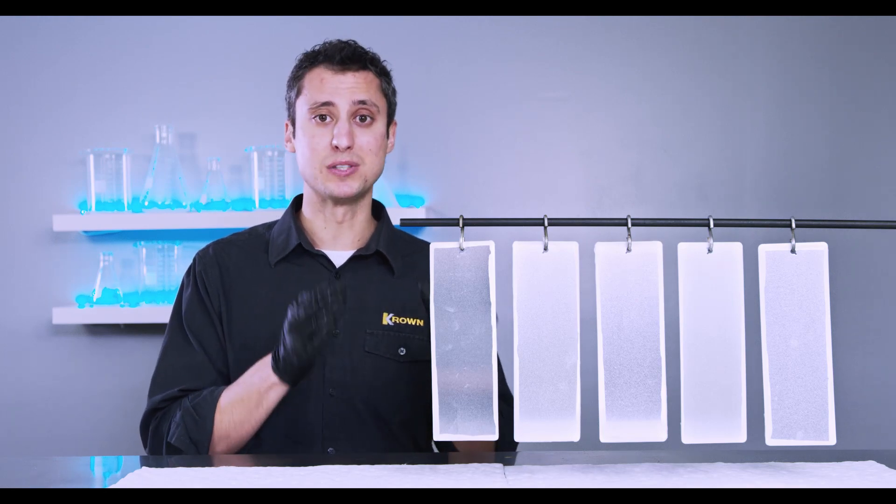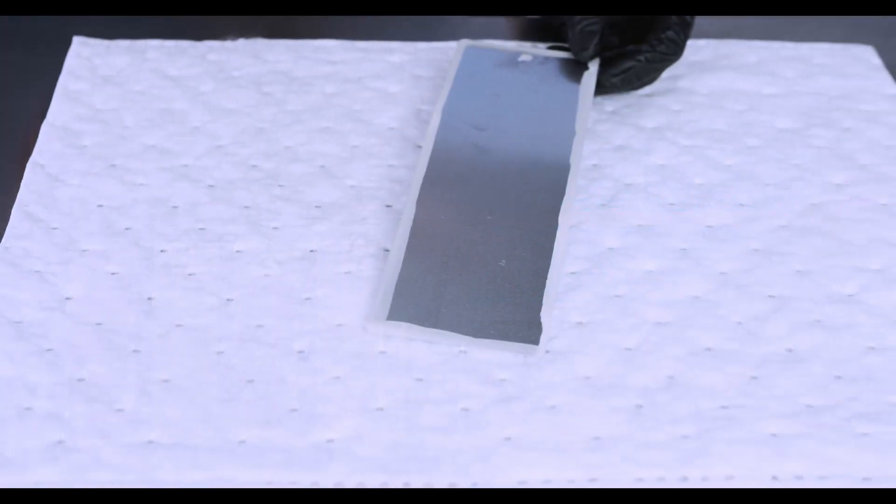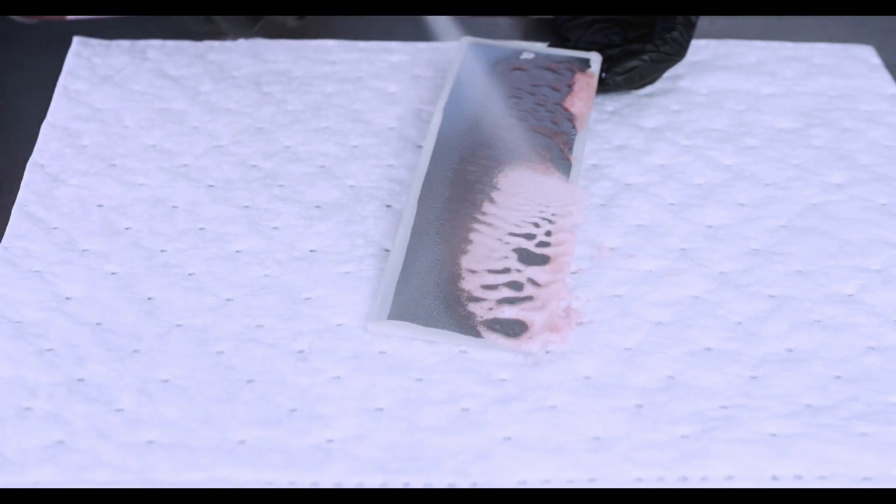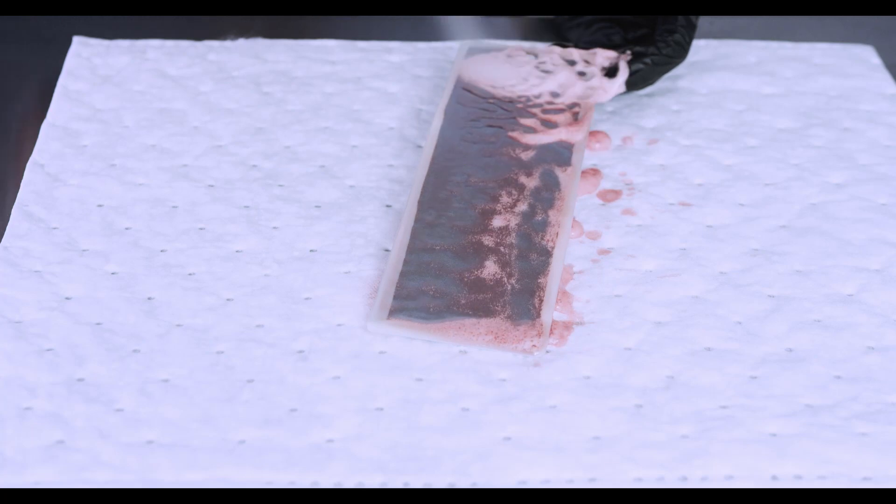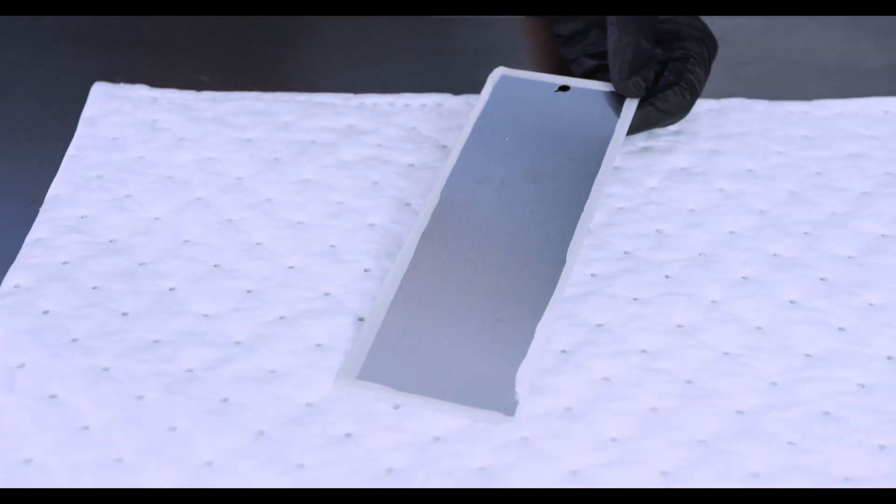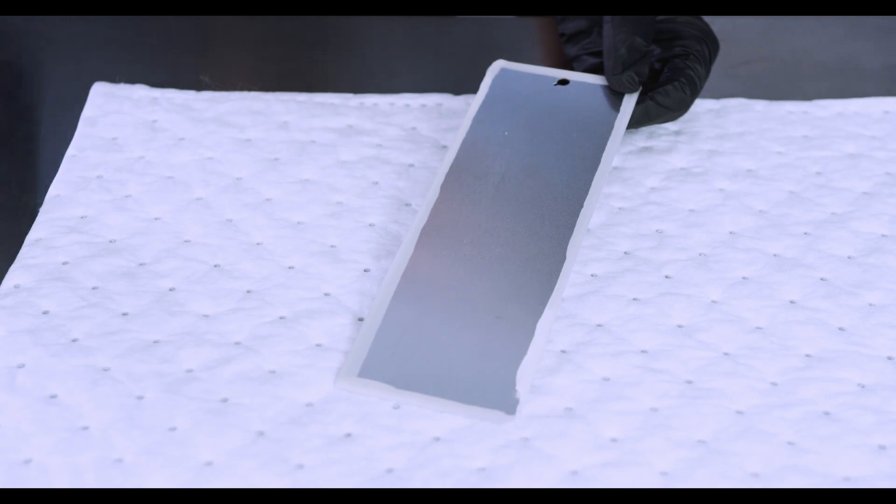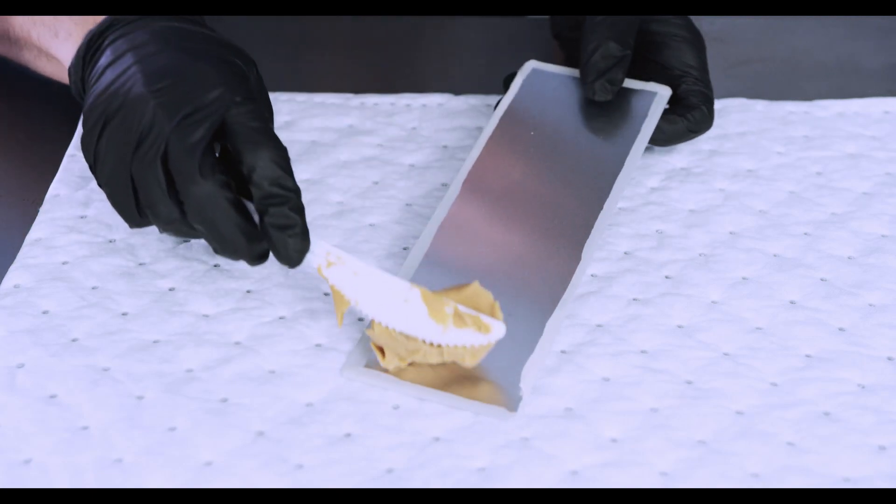So let's apply those different products. Here we're going to apply a very popular oil-based rust protection product. Now to illustrate how something can be a great coating but not necessarily a good rust inhibitor, we're going to apply peanut butter to one of these panels.